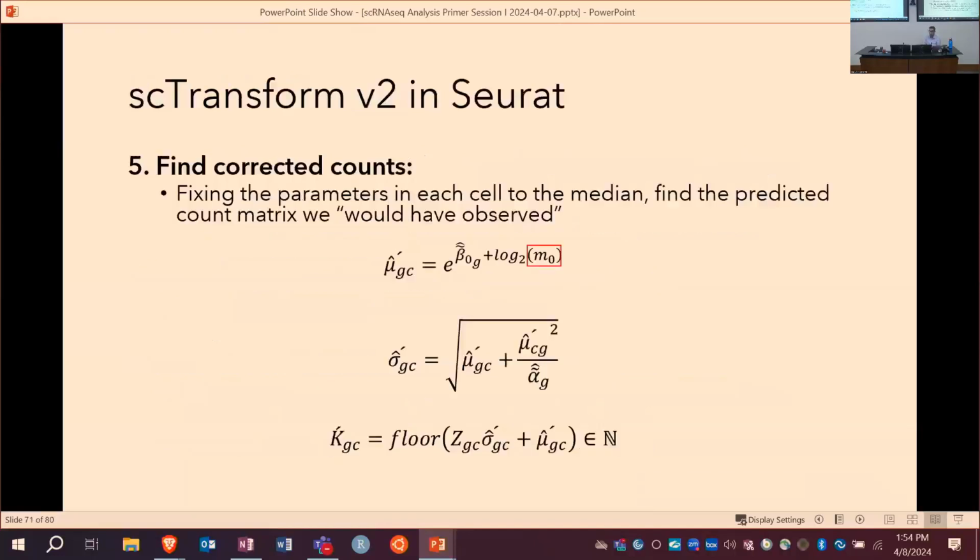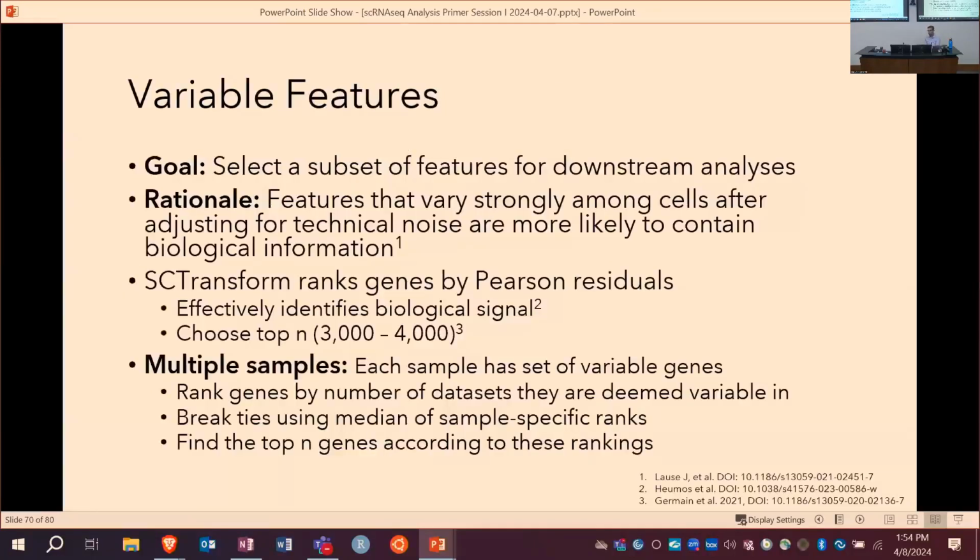Could you remind me what the variable features specifically contribute to downstream analysis as opposed to non-variable? Like the other, non-selected genes, can you factor those in for clustering or anything else?